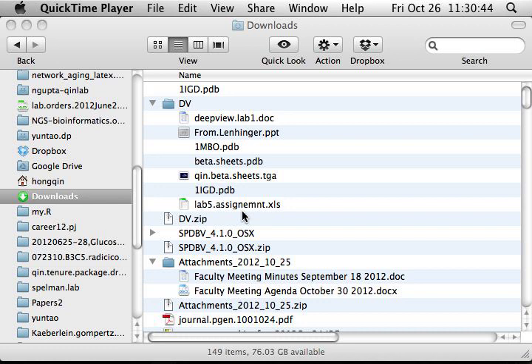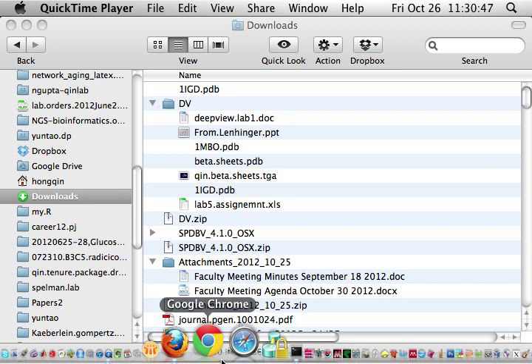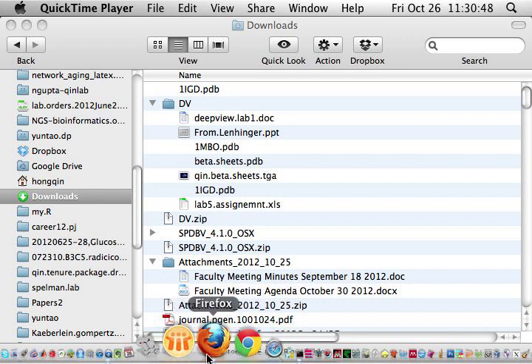In this video, we talk about the basic usage of Swiss PDB Viewer.